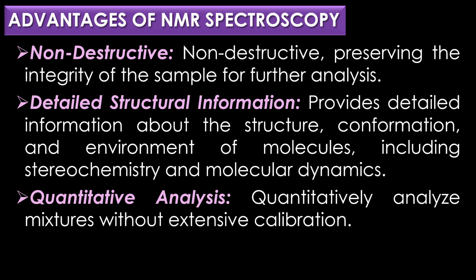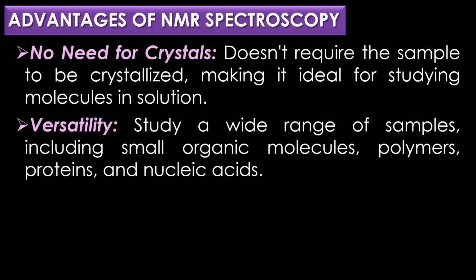Quantitative analysis is the third advantage. NMR spectroscopy can be used to quantitatively analyze mixtures without extensive calibration. The fourth advantage is no need for crystals. Unlike X-ray crystallography, NMR does not require the sample to be crystallized, making it ideal for studying molecules in solution.